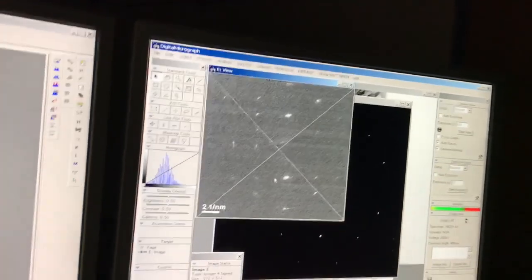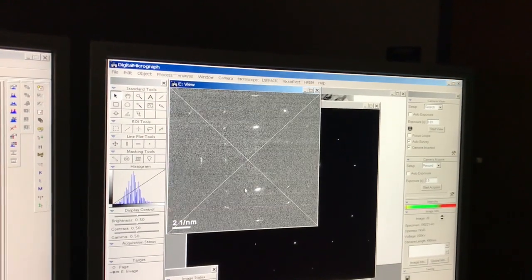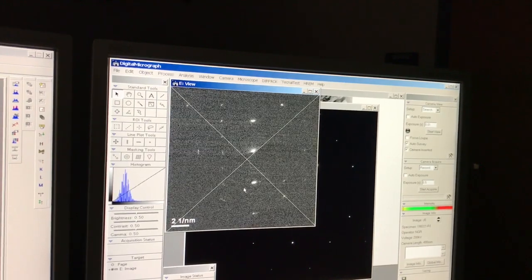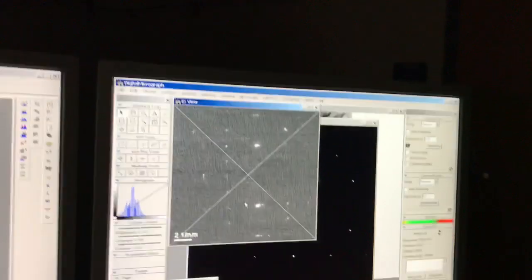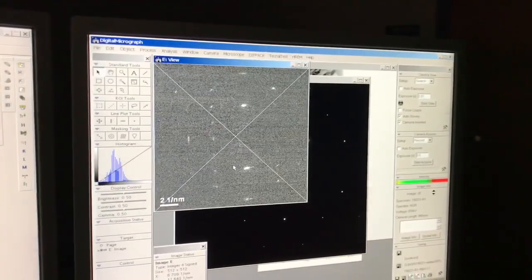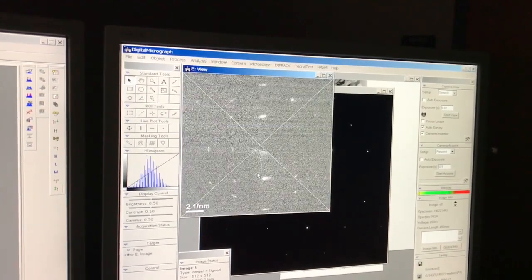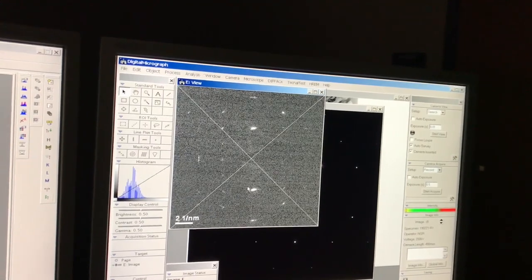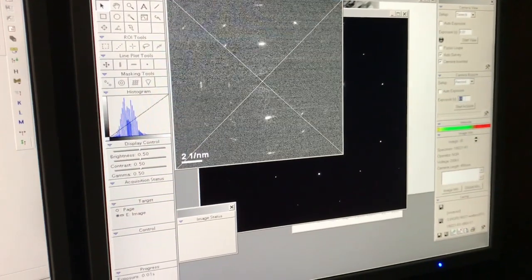One of the things I can do just to demonstrate this, if I use the multifunction knob, you can see the pattern shift around. See there, and I'm starting to see the direct beam. I don't want that. You don't want to see the direct beam. I could probably shift the pattern a little to the left. Yeah, there we go. Again, you want it centered just for aesthetics. Right about there, that looks good. And again, I'm going to do a test exposure, so I'll do 0.1.